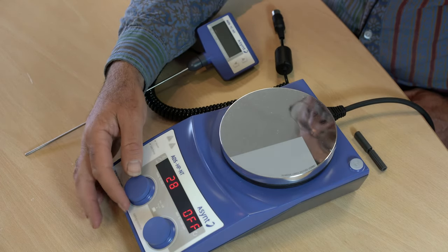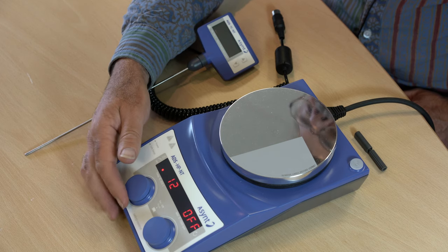This is fine — it will control the temperature safely. However, just in the chance that it could go short circuit or something, our hot plate stirrers also come with a small plastic screwdriver.